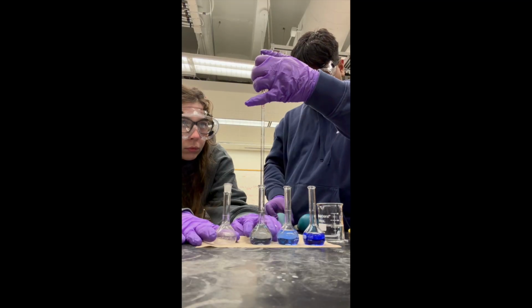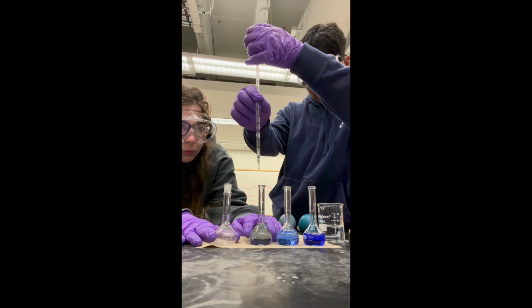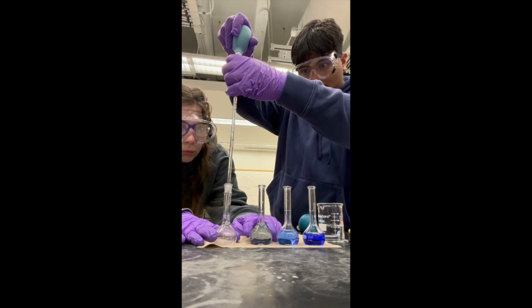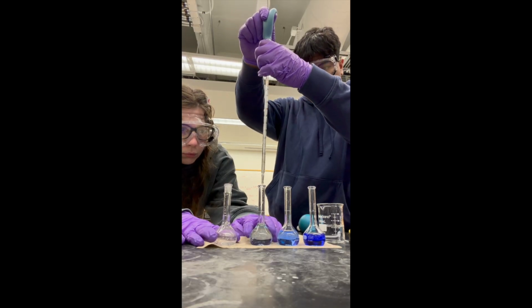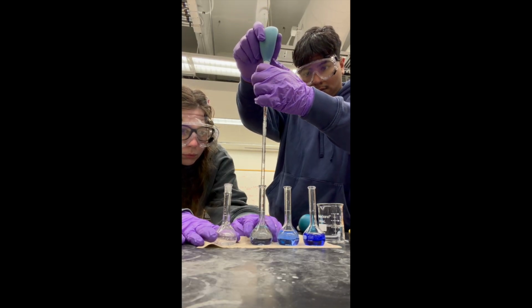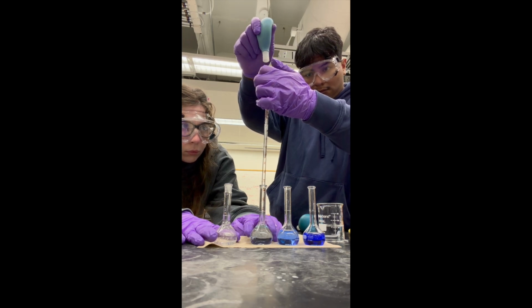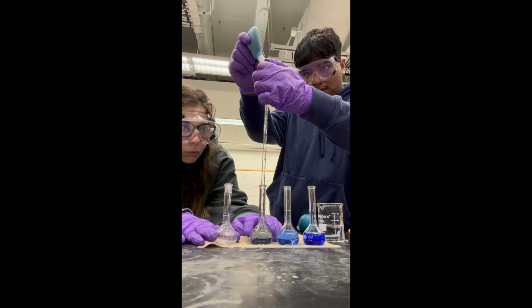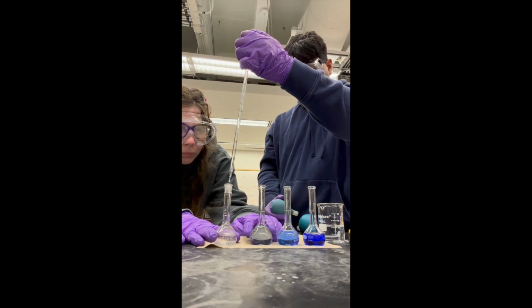During this part of the dilution, which is the last set, we add 5 milliliters of the second dilution to the new empty flask using a pipette. The reason we use a pipette is so we could get accurate measurements of how many milliliters we put into the new flask. And we also make sure to read from the meniscus so we can be accurate and consistent.